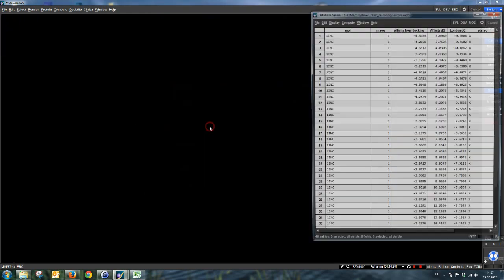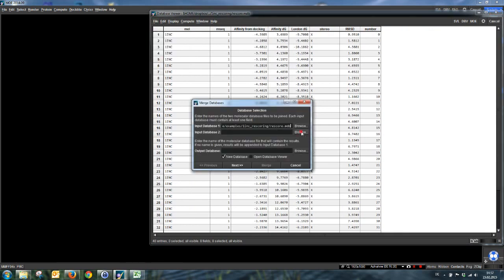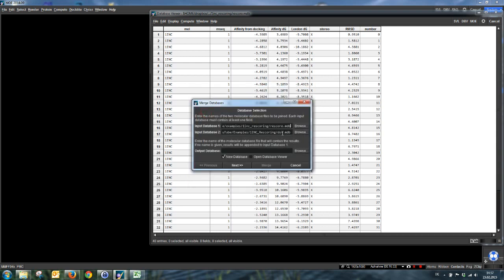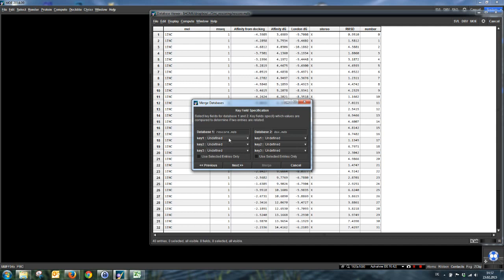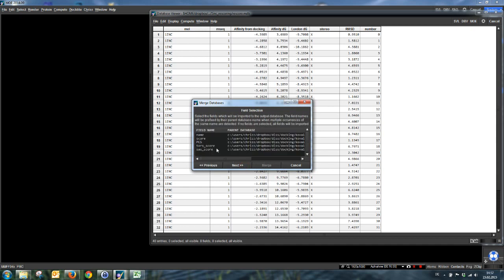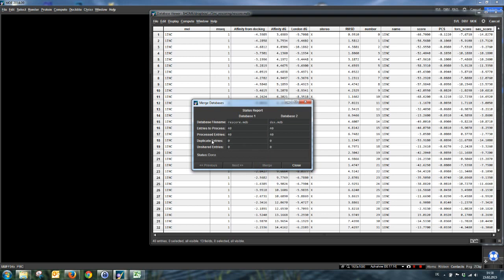And now the workaround is nearly finished. We can open rescore MDB. Go on file merge. We want to merge with the temporary DSX MDB. Not in a new database, but in the input database one. So we unclick new database. Go on next. And now you see why we generated this number field. We need a key field that is exactly the same in both databases. And this is the number field. Now when Mo asks which field we want to import, we want all, so we don't have to do anything here. And there are only shared entries when we did anything right. So we can just import shared entries. And here should be no duplicate and no unshared entries. Otherwise something went wrong. And maybe you have to start again with the rescoring process.